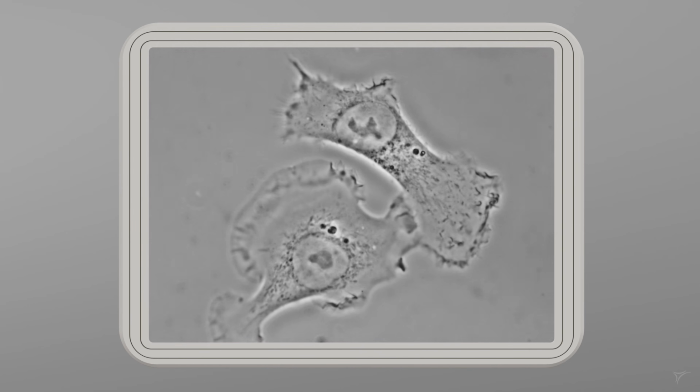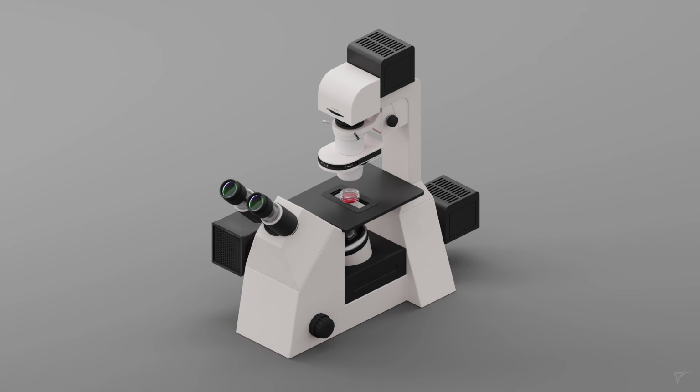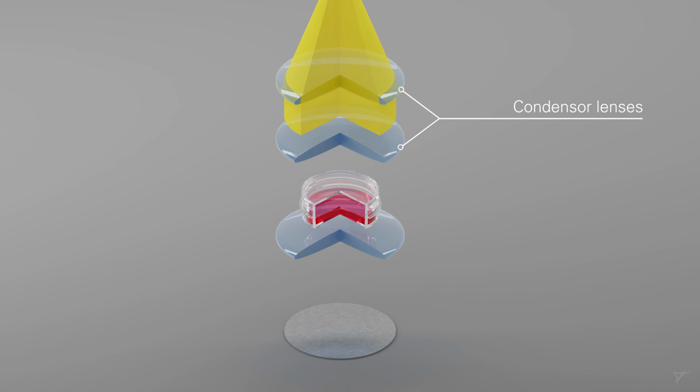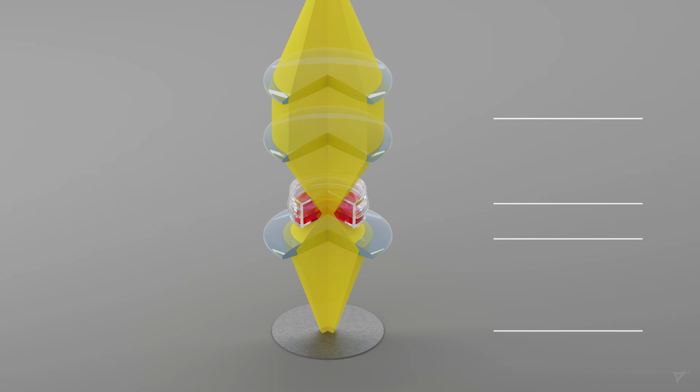Unstained living cells absorb practically no light, making them nearly invisible under a brightfield microscope. With phase contrast, structures that are nearly invisible with a brightfield microscope are revealed. To understand, let us have a quick look at a standard brightfield microscope. In a brightfield microscope, the lenses in the condenser focus the light on the sample, which is then collected by the objective and then projected to the camera chip or an eyepiece.